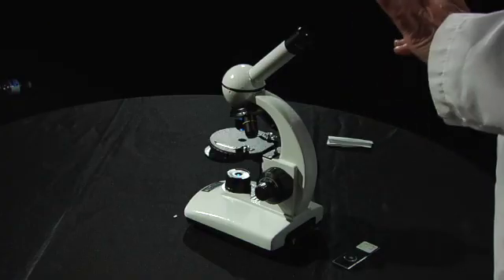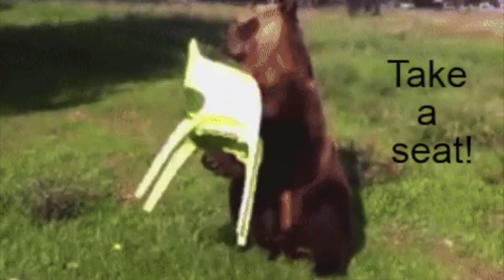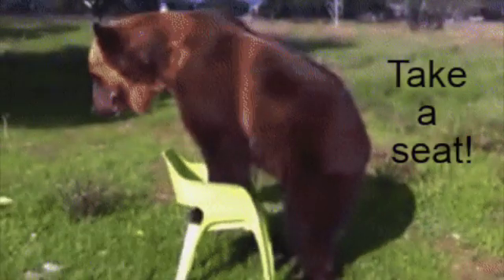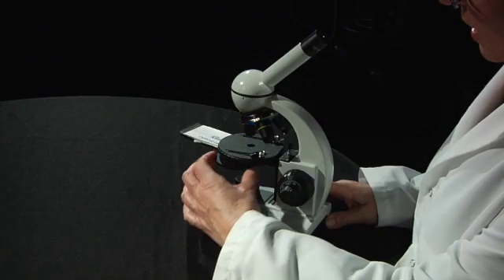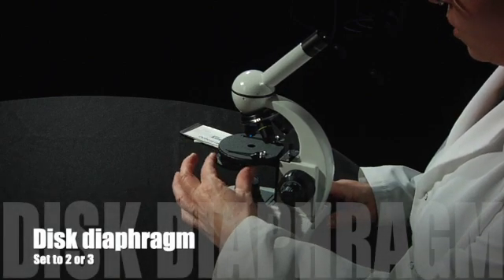We are ready to use the microscope and the best thing to do is to sit down while you're using it. The first thing you're going to want to do is turn the disc diaphragm until you have the number two or three clicked on, and that will help have the light shining at your eyes at the right level.